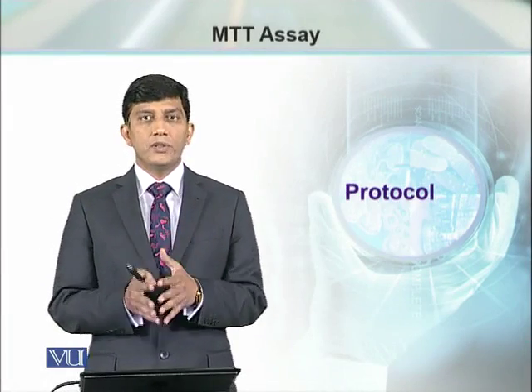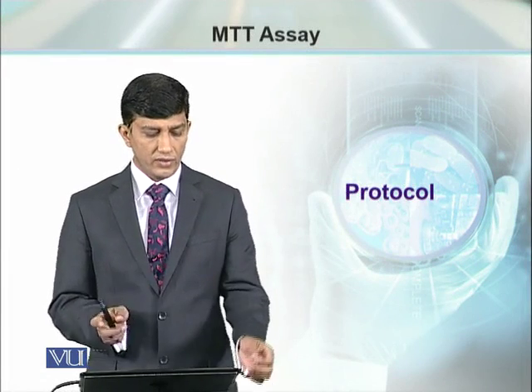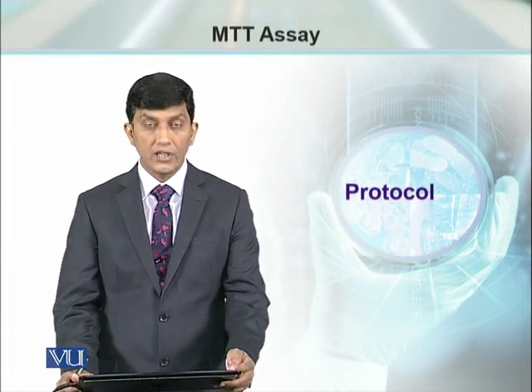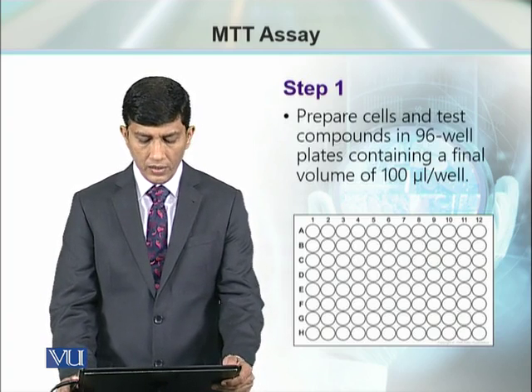We have prepared the solutions required for conducting this MTT assay. Now let's proceed to see how we can start and set up this assay.